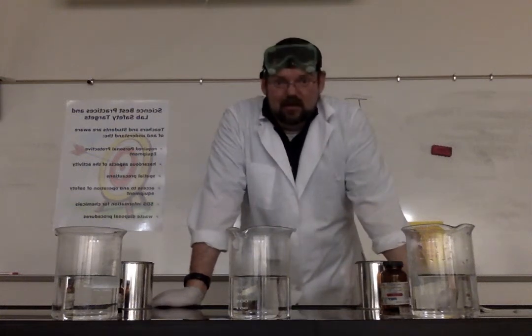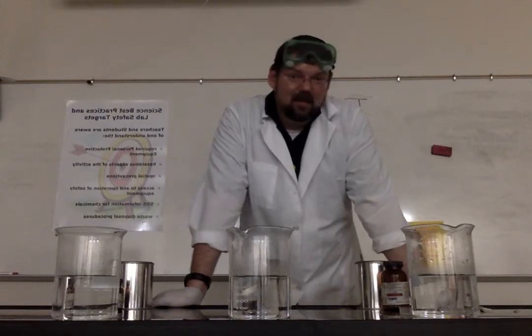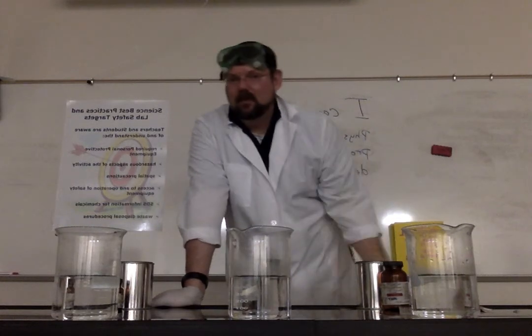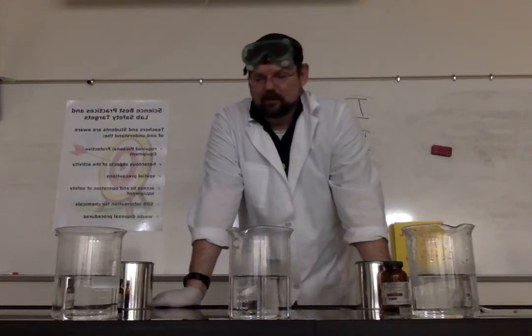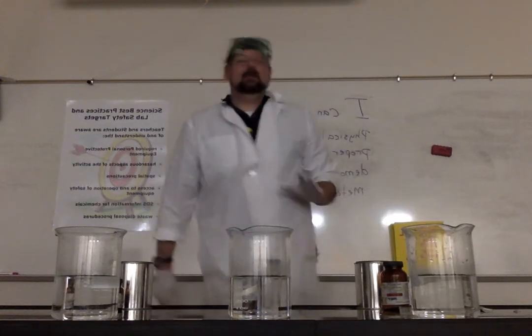But there's an instance where I may need water. According to the MSDS, if I get a little bit on my skin or if I get something called a residue, which is a little bit that's left over, then I should rinse off in the wash station for 15 minutes. And then if I need extra help, I need to call first aid. So, all right. Now we understand what we're working with.